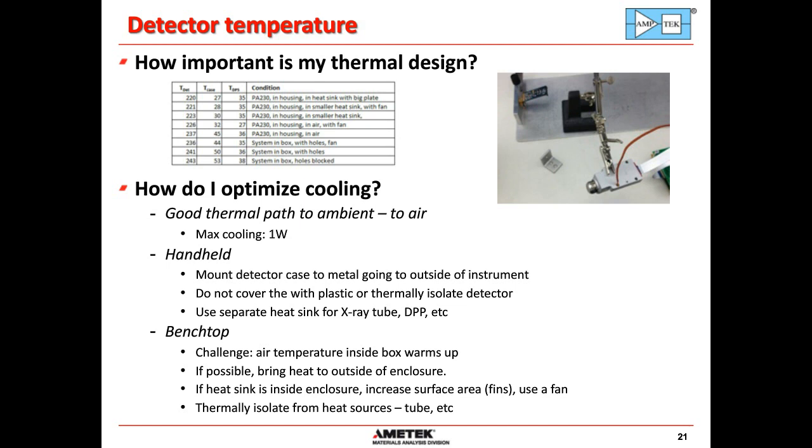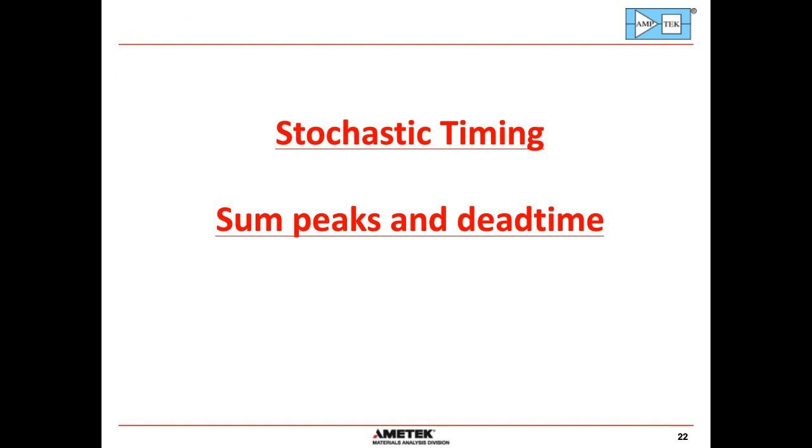Another set of issues outside of intrinsic noise is pulse pileup and dead time. All this occurs because of random timing. X-rays are produced at random times, uncorrelated in time. I will say, I had some questions about pulsed applications. When you have a pulsed system, then the X-ray production is not random in time, so none of the formulas here apply. All of the standard formulas assume you have random timing, so pulsed systems are a completely different thing that I will not be addressing in detail here.